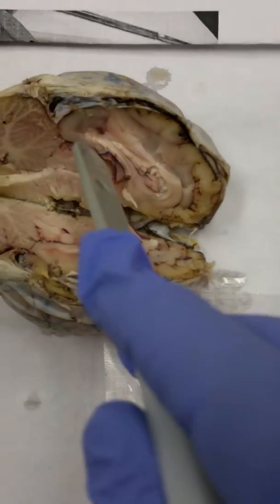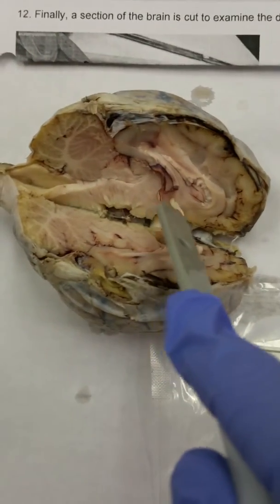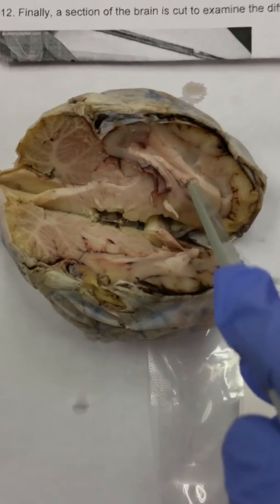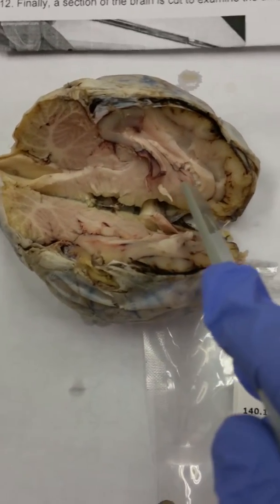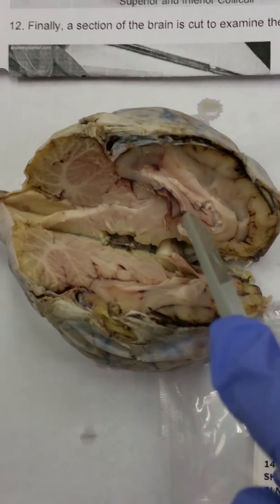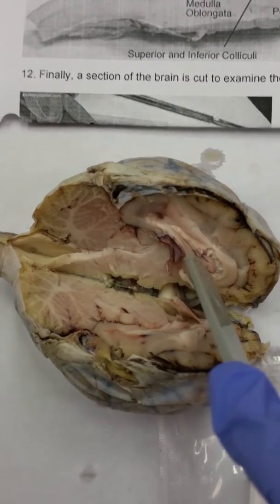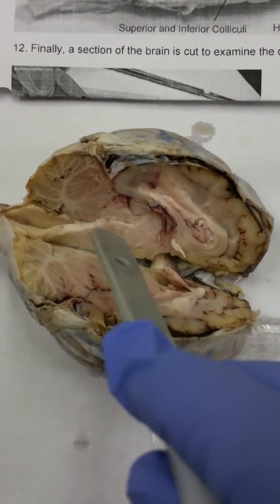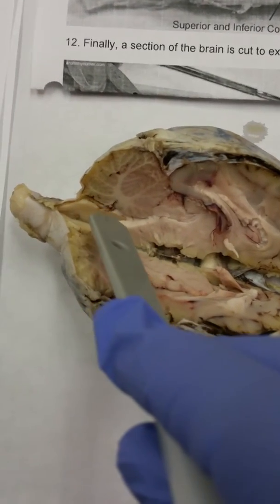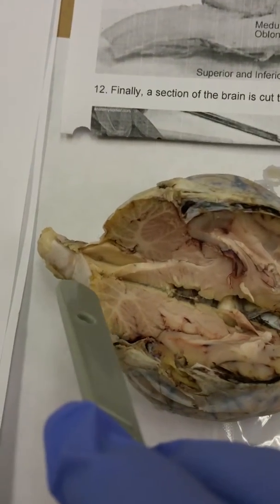As you can see, it's right here. That's the fornix with my scalpel, and then we're able to see where all the ventricles are. A ventricle is right here, the lateral ventricle, and we're able to see the cerebral peduncle, and then again looking at the pons, we remember that from before. The medulla oblongata, of course, and our spinal cord over here is a reference point for us.